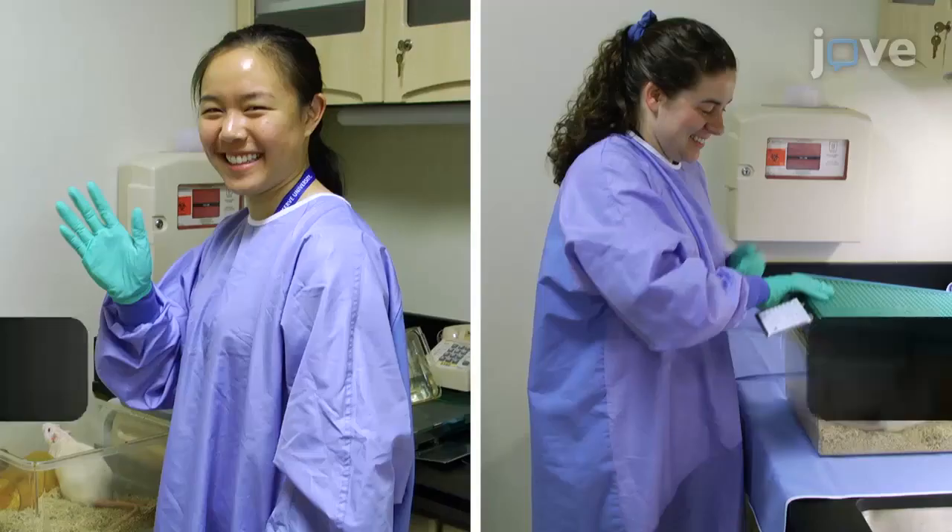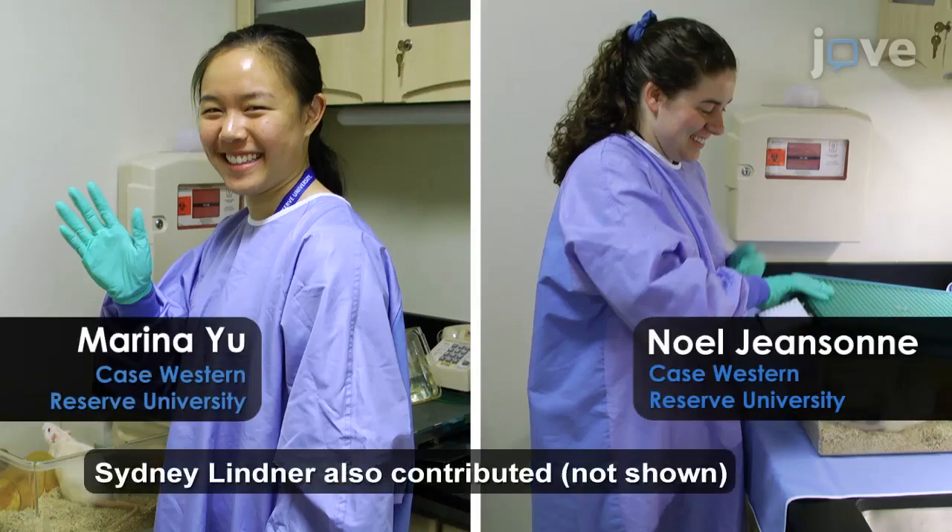This method can help improve consistency in small animal behavioral testing by creating objective motor function metrics. The advantage of this technique is that unlike conventional methods, the results are quantified by a computer system which cuts down on human error, effort, and time. Demonstrating this procedure will be Marina Yu and Sydney Lindner, undergraduate researchers from the Cappadonna lab.